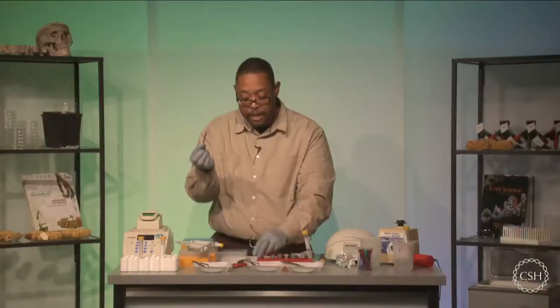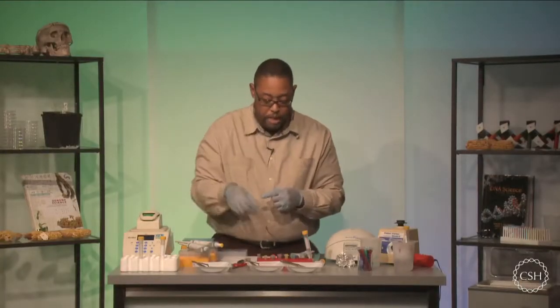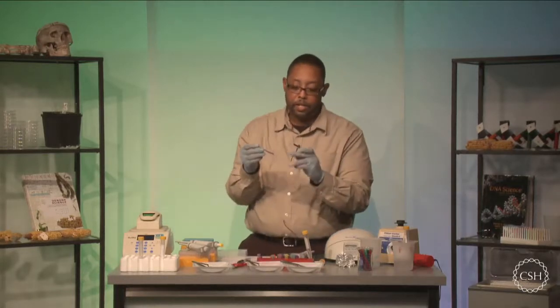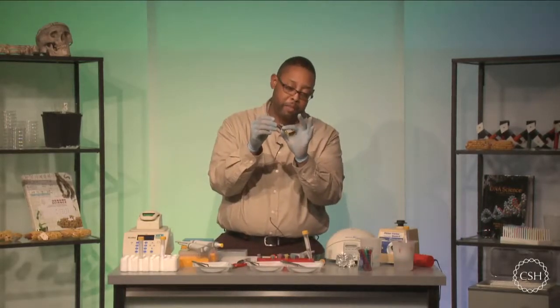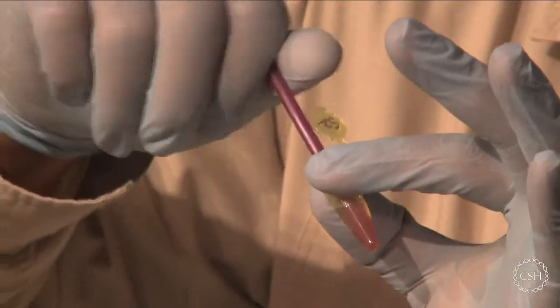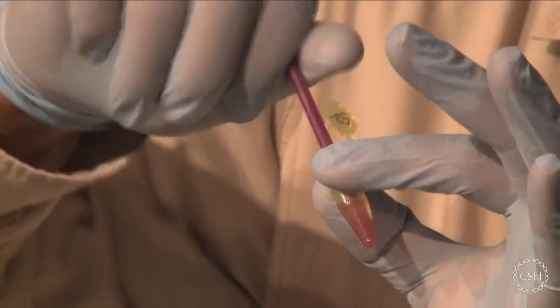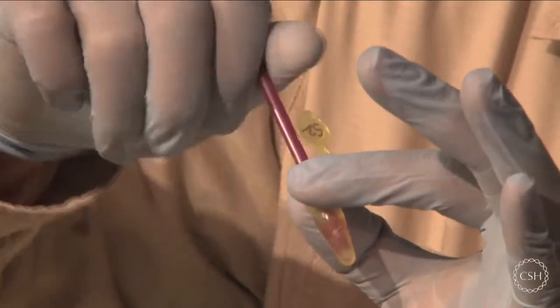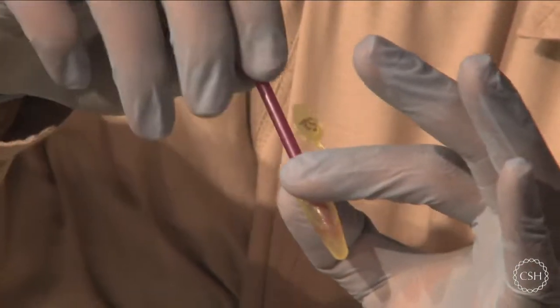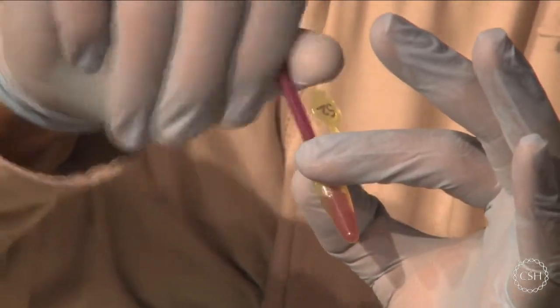I'm going to close that up and I'm done with this pestle, so I'm just going to push it to the side. Sample number two is my meat. And again, you're going to want to make sure the tissue is back down at the bottom of the test tube. But you're going to notice that most meats do grind up very easily inside of this lysis solution. So please make sure that you get thorough grinding, but that most of the tissue is nice and evenly mixed into the solution.